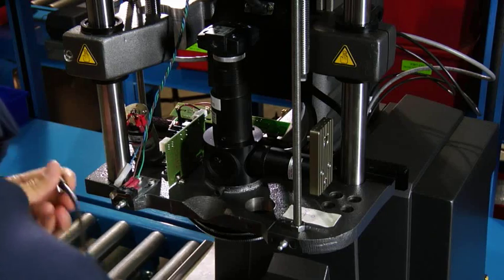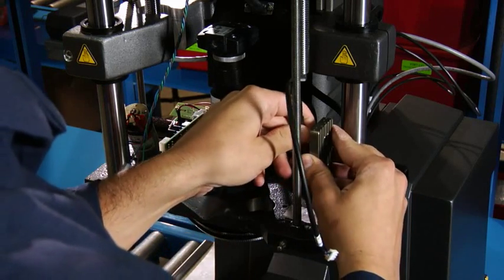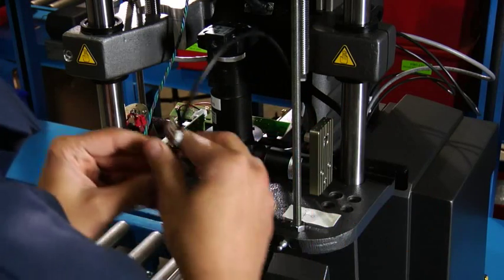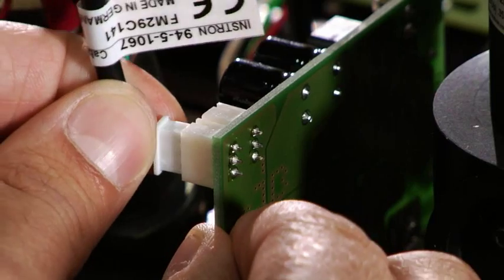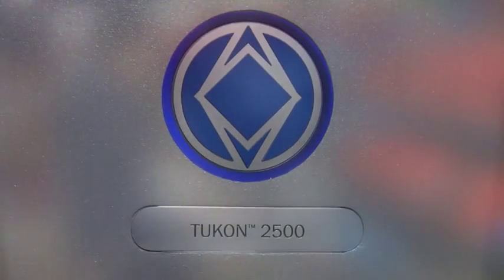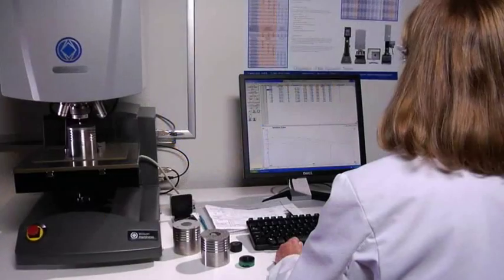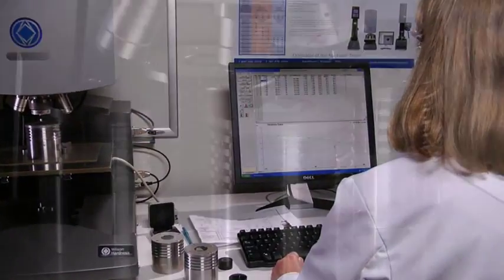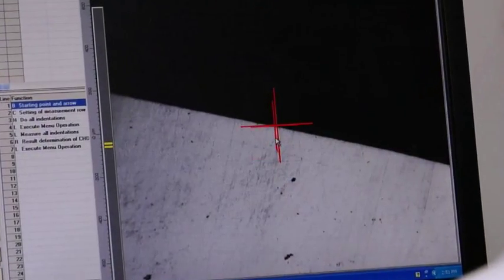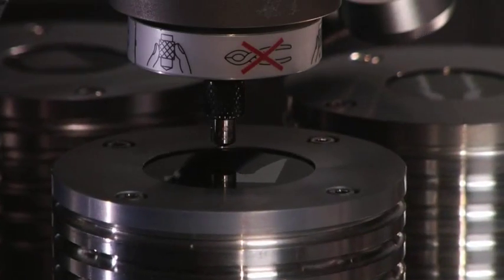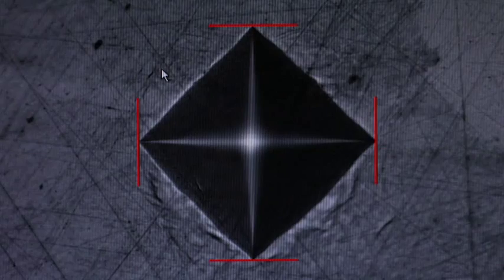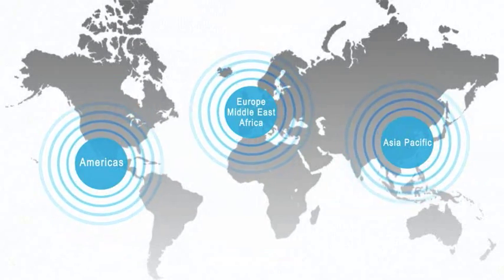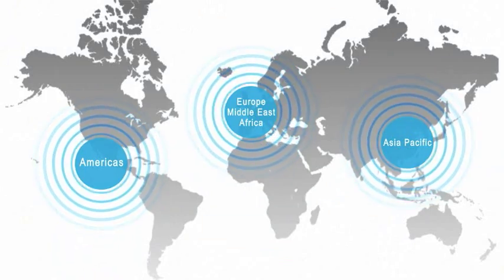Wilson testing systems and automation software are designed to increase productivity, accuracy, and efficiency, while maintaining strict compliance to ASTM and ISO standards. With over 300 years of combined experience in the industry, we have solutions for your most difficult testing requirements. If you are looking for a means of streamlining your testing process, increasing efficiency, and achieving more accurate and repeatable testing results, contact Wilson hardness and learn how our automation test systems can benefit you.